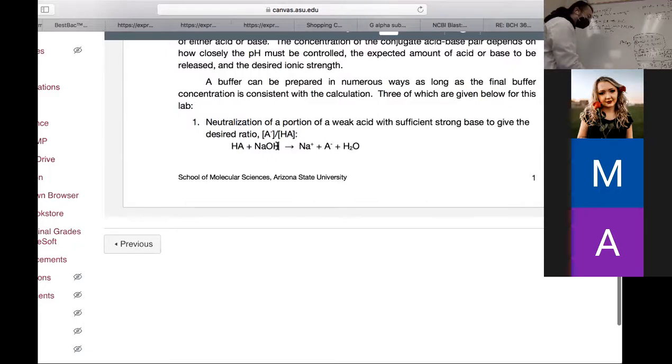So you just plug the result you got from here into here, and that will be equal to the concentration of HCl. Then you can know how much HCl you need. Okay, so method 1 and method 2 are similar things. If you know this, you should be able to do this.